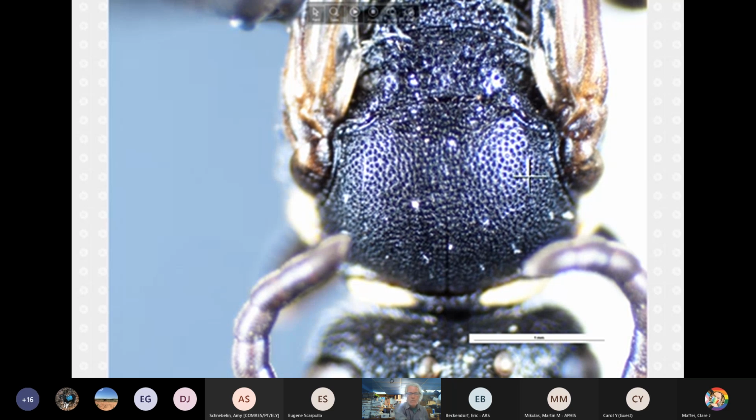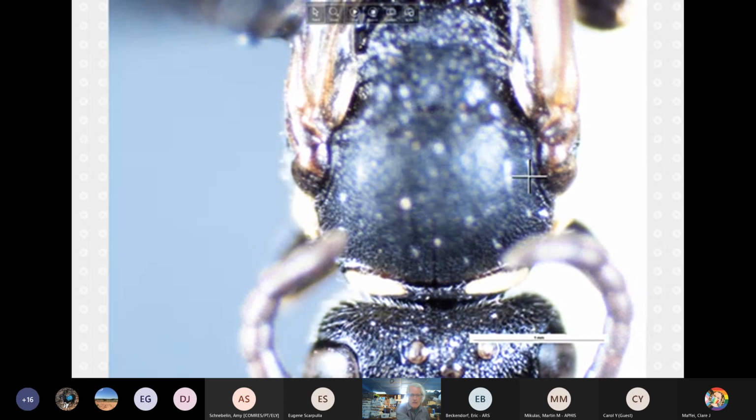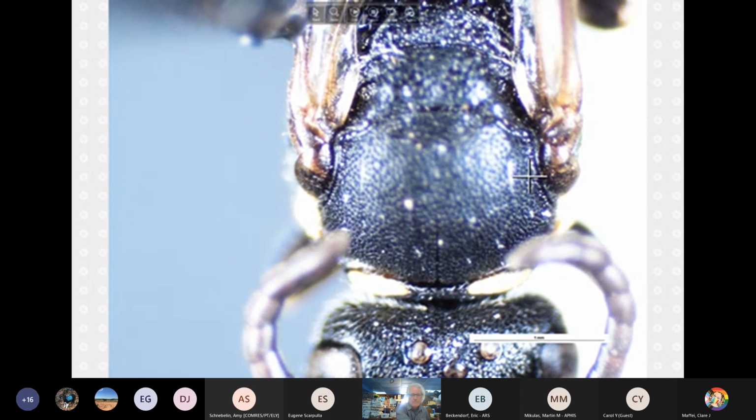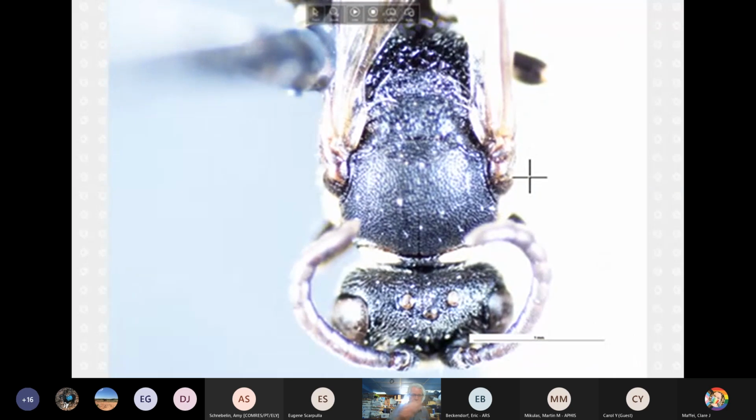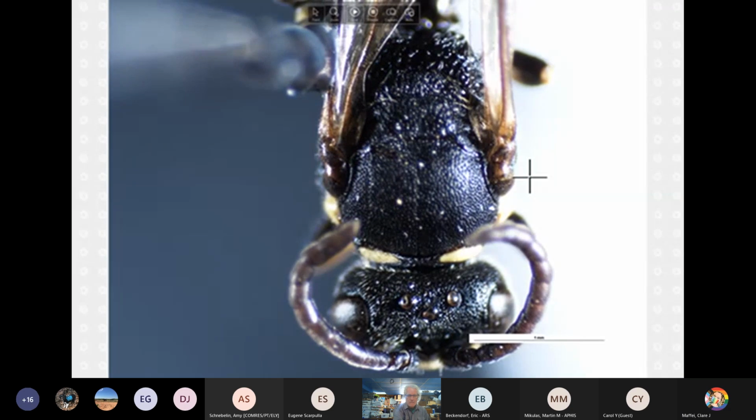Okay, also, now that we're here, we're noting things such as the fact, let's go down a couple notches. Yeah, I was going to say, Sam, that might be actually a little bit bright and washed out. Yeah, I just wanted to get the black back, so we can scale it back now.